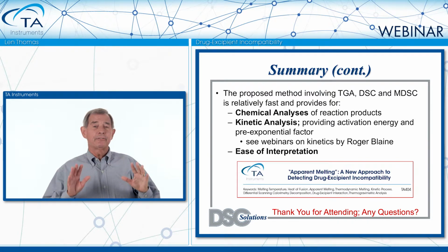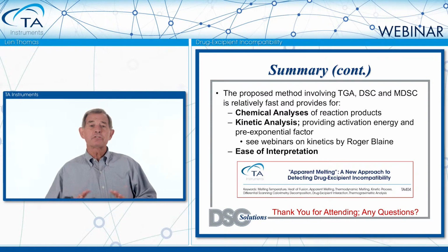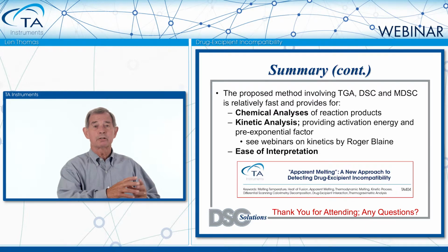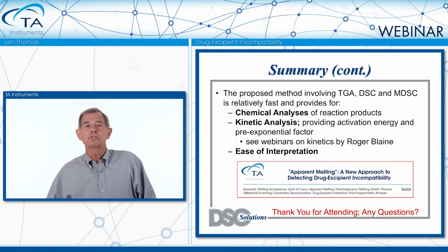Now, the fact is there's no way that we could get into kinetics beyond the activation energy and pre-exponential factor today. But if you're interested in taking the information that you obtain here and doing complete kinetic analysis on it, Dr. Roger Blaine has created two webinars here on the TA Instruments Library that go into detailed discussion of kinetics.